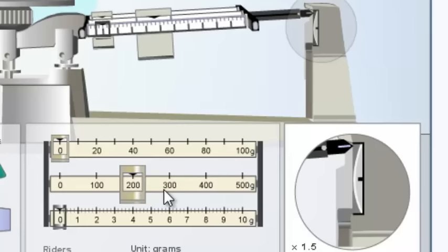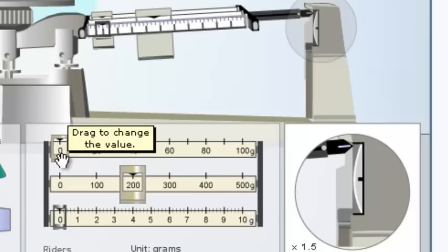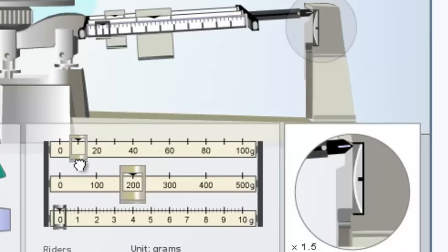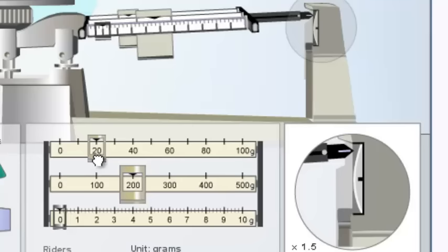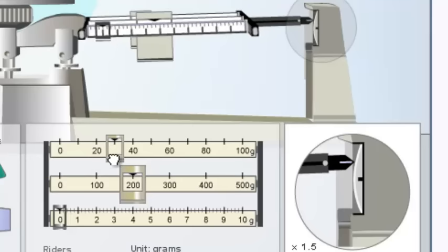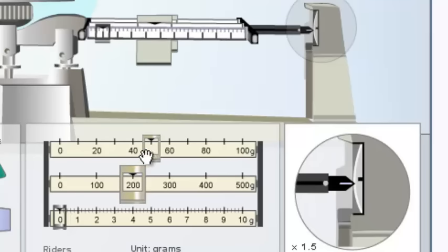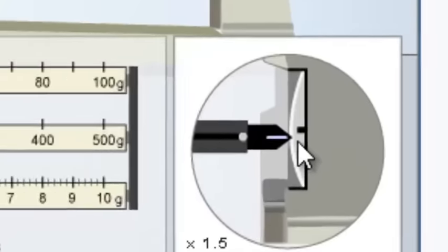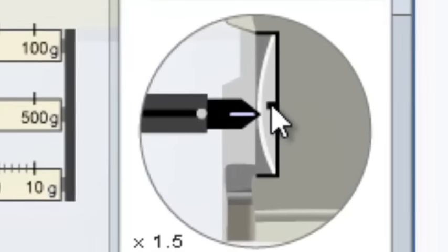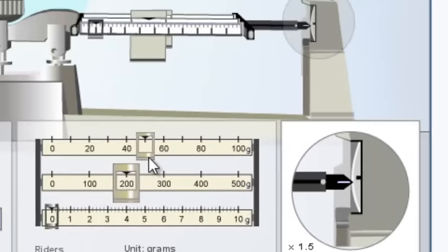Once we figure out how many hundreds of grams an object may have, then we go to the tens to try to get a more accurate reading. So I'm going to go 10, 20, 30. It's starting to drop so we keep going. 40, that's close but it's not perfectly lined up. So we then go to 50. If you take a look at 50, 50 has now dropped the pointer below the line. So 50 grams on this rider is too much so we move it back to 40.